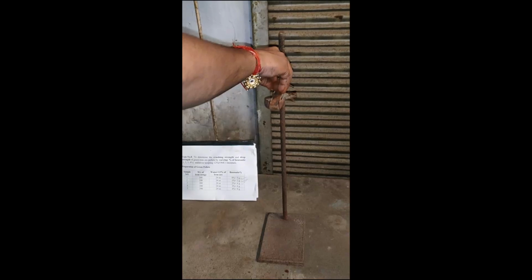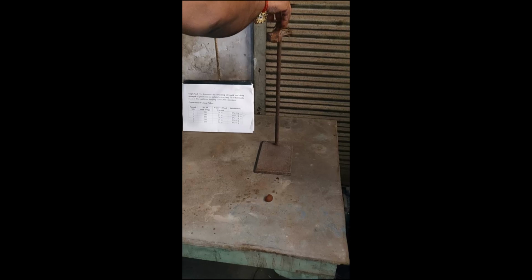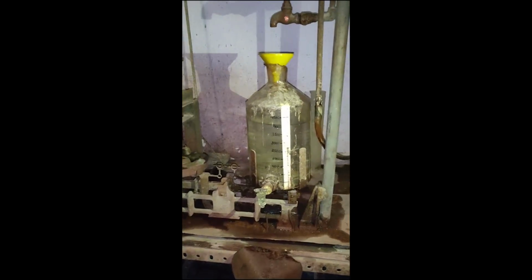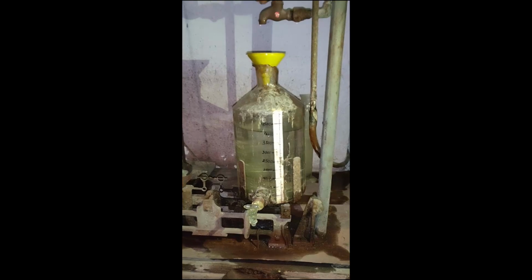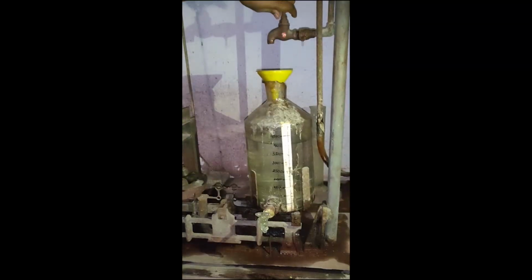Of 3% of bentonite. First drop. Second. Third. Fourth. Crushing strength. Filling the water and applying the force on the pellet.